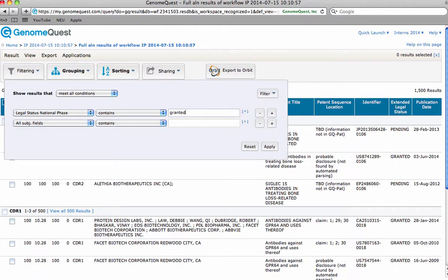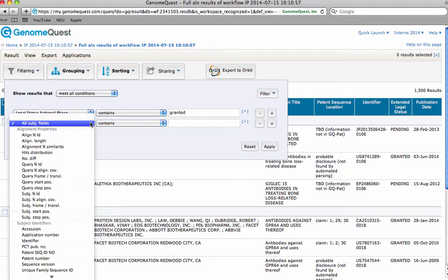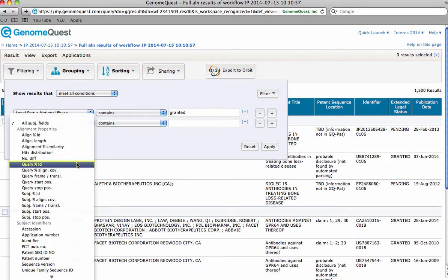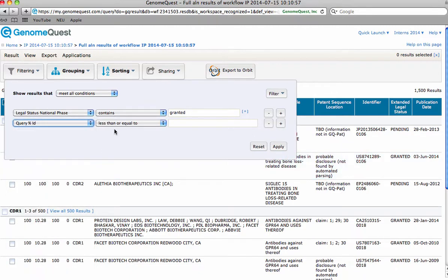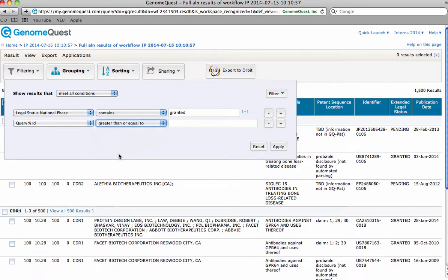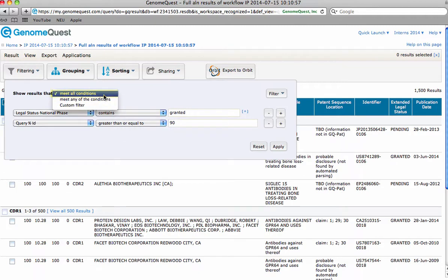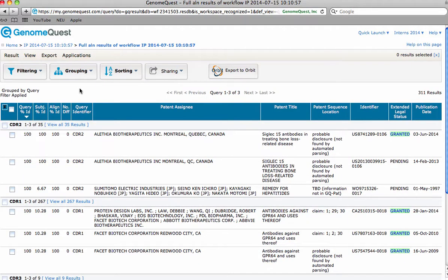Let's set a second condition to query percent identity, giving us documents that are greater than or equal to 90% for a high identity yield. Let's join the conditions using logical AND. The number of results drops from 1500 to 311, making a significant difference in the amount of results that you have to manually sift through.